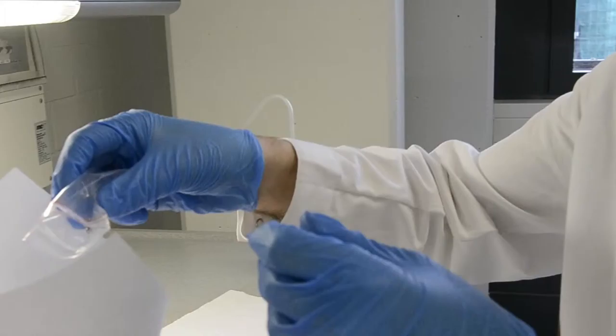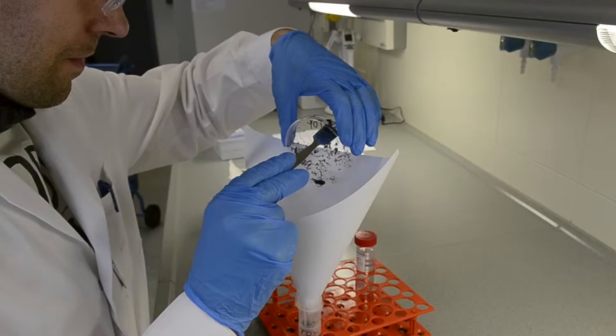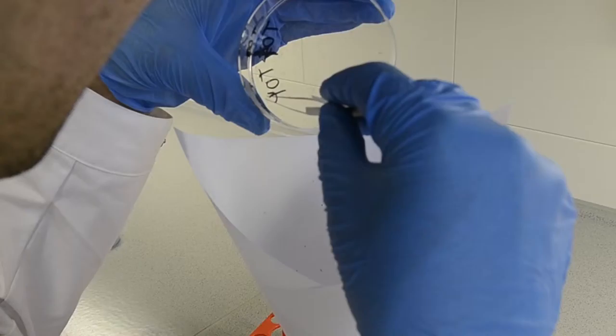Next, ten steel beads are added into the tube for grinding. Then, the specimens are carefully scraped from the Petri dish into the tube using the funnel. They are electrically charged, so it can be quite difficult to remove all of them.